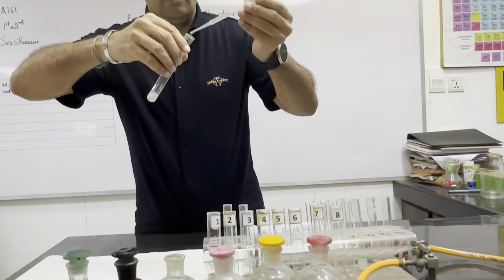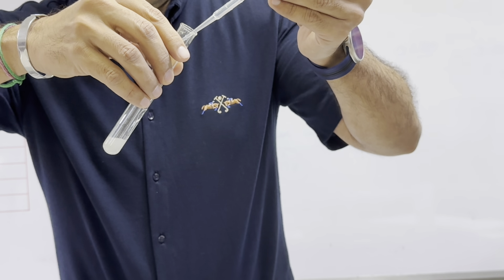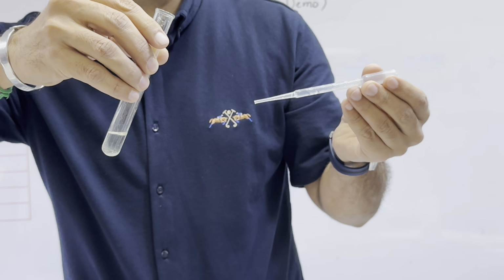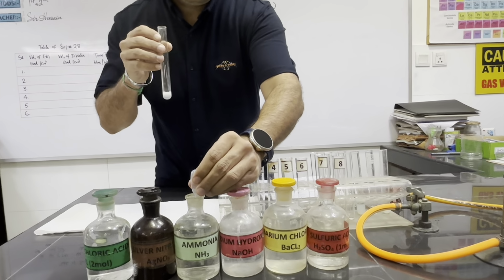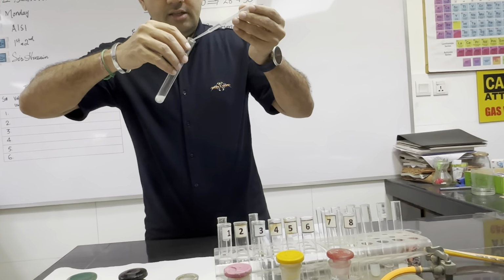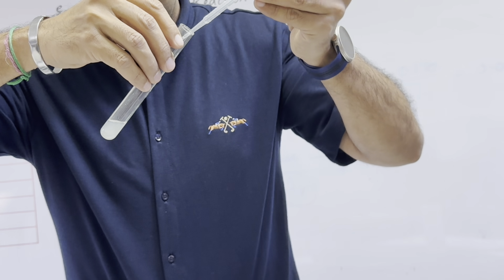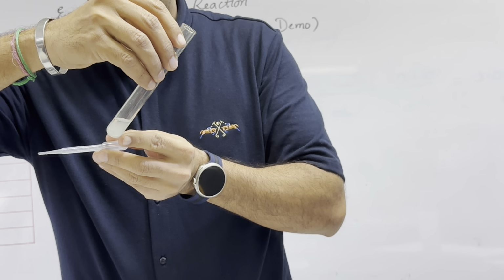So in this solution where we have taken Fa2, if we add aqueous ammonia, the precipitates dissolved completely, which shows that it's a chloride containing salt. In the case of Fa3, the white to off-white precipitates are not dissolving completely. They are getting lighter, meaning they are partially soluble, but not completely soluble.